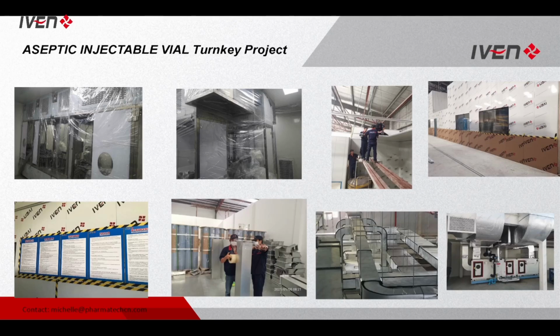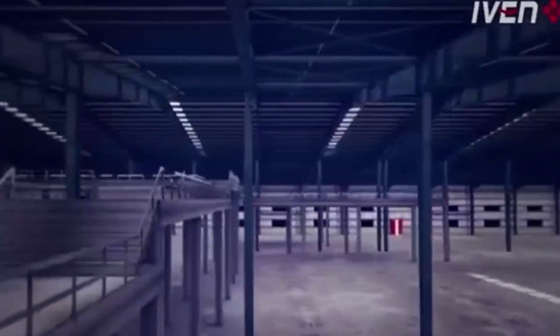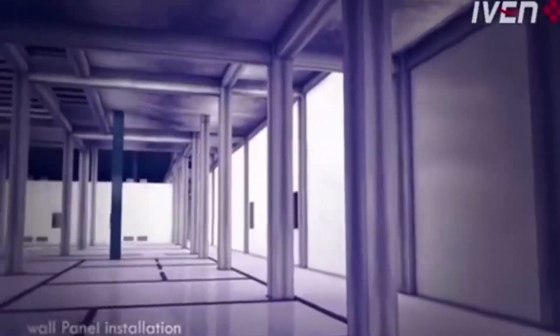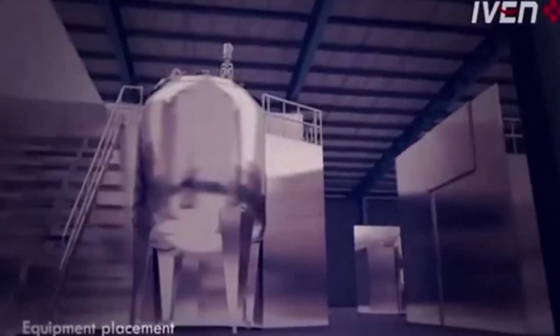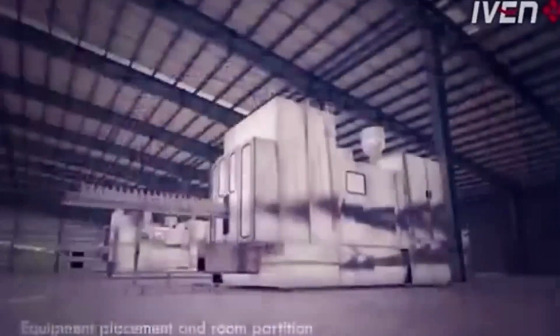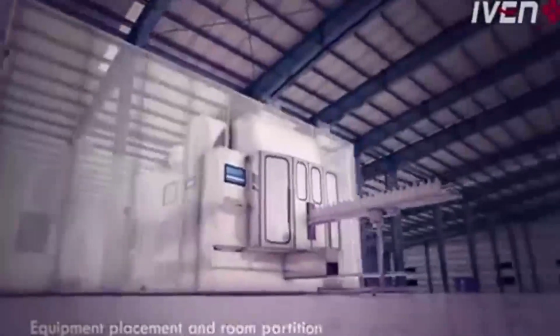I would like to share a short video of our clean room project, the clean room erection process, roughly. You can see from this video, firstly the machine location, and then erection of the clean room wall panels, and then installation of the doors, the windows, and the flooring.